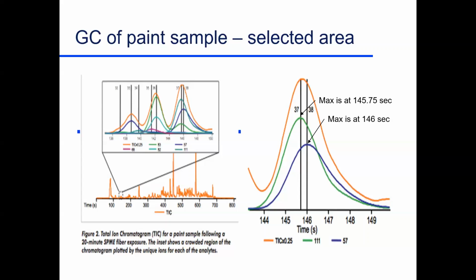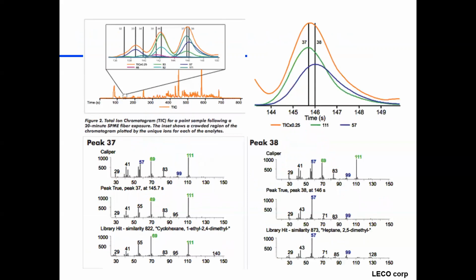We've never quantified that with the gas chromatograph. But all of a sudden, the mass spectrometer is tuned to look at just that. You just look at that, and you can quantify a compound without two compounds there, without ever separating them. That's pretty darn neat when it comes right down to it.